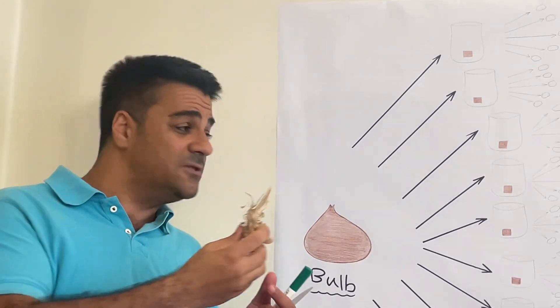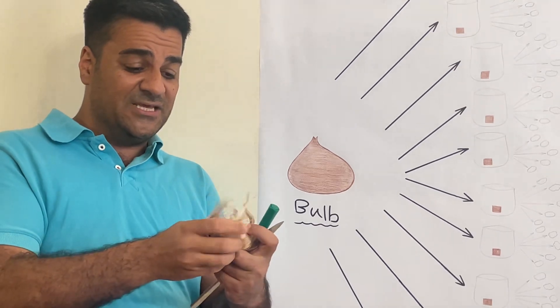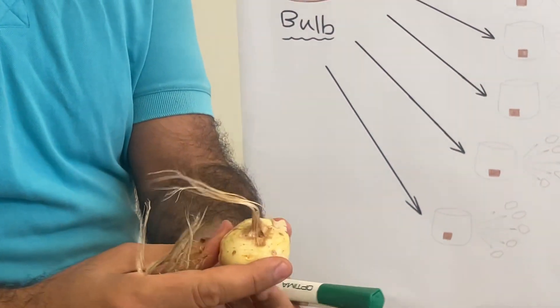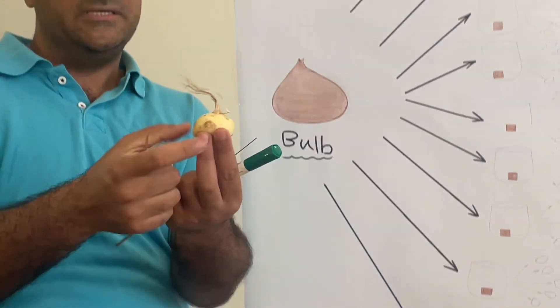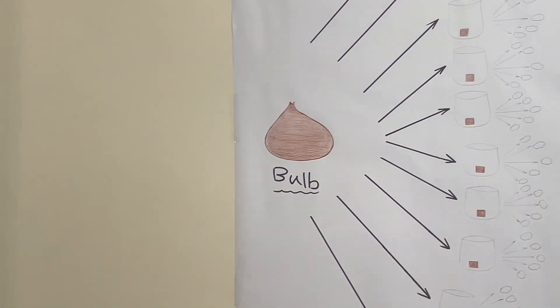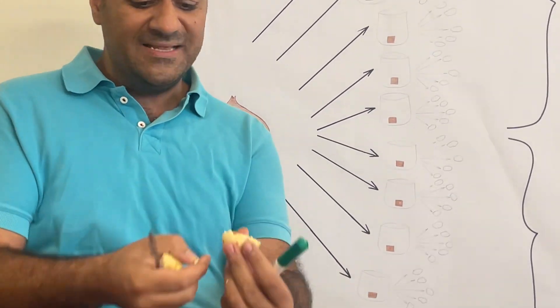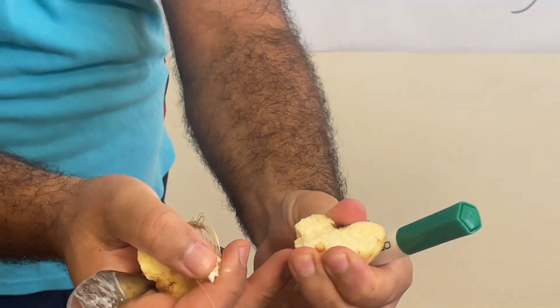What is the meaning of healthy? The bulbs that you want to start the tissue culture — for example, when you remove these outer shells for the first step, it should be completely white. This bulb is completely white, completely heavy — near 40 grams — and I want to choose it for tissue culture. When you separate it with the knife, look — completely white, very fresh, completely fresh.